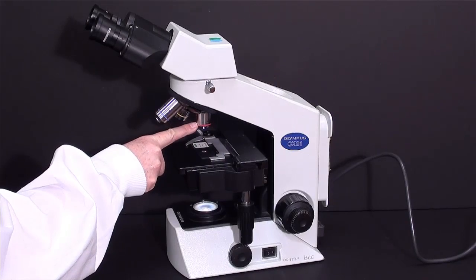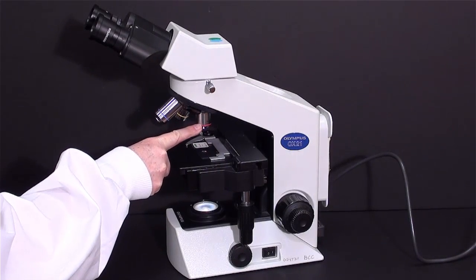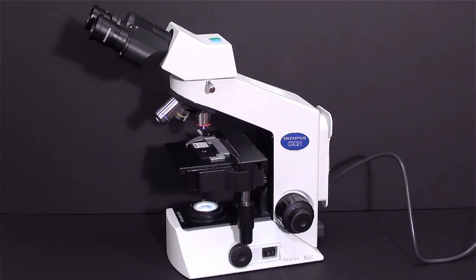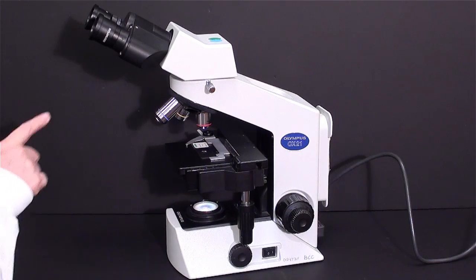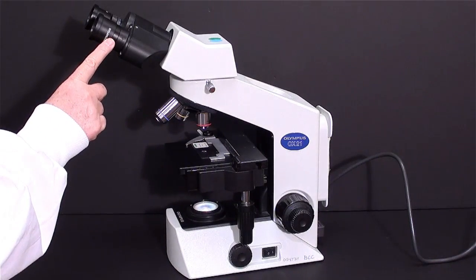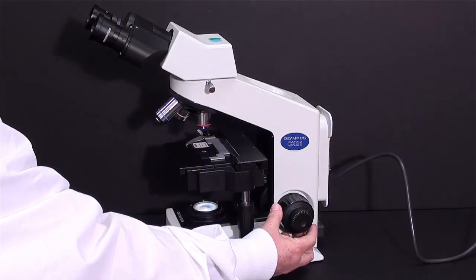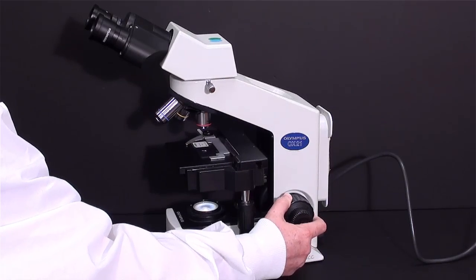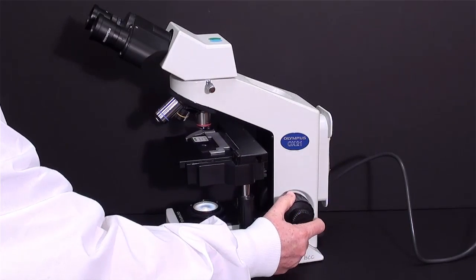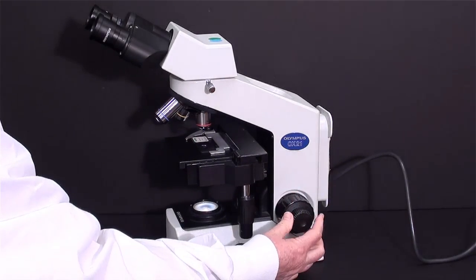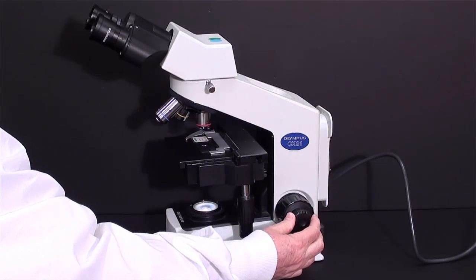Begin to look at it with the scanning lens. That's a short small lens. Look through the eyepieces to see what you can see. Use the coarse focus knob to bring the object into focus, and use the fine focus knob for fine adjustment.